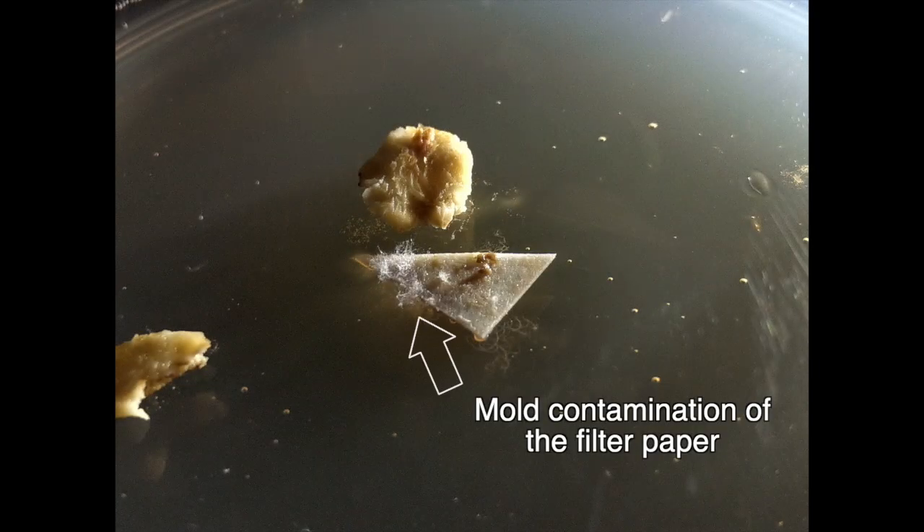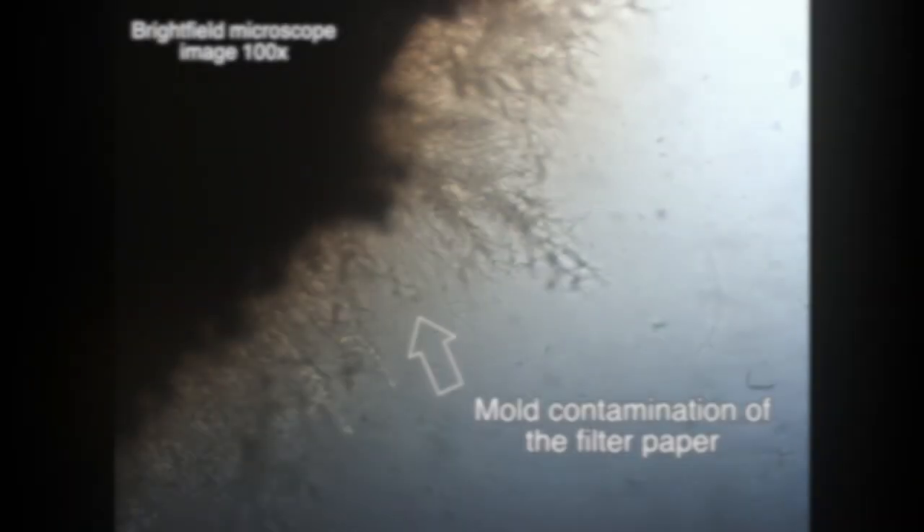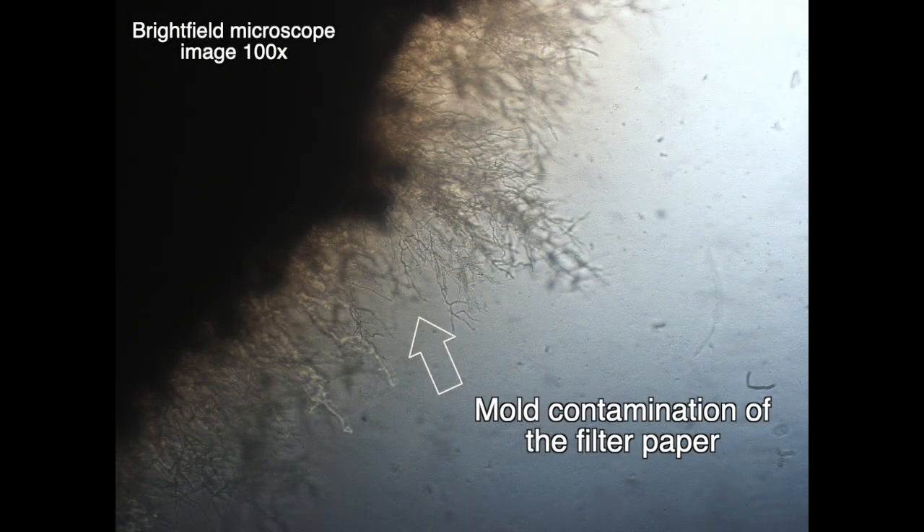By looking at microscopic images and the petri dish itself, mold contamination was observed after cultivation. Mold is one of the major obstacles for P. polycephalum and restricts its growth and development. That's why it needs to be eliminated in further studies.